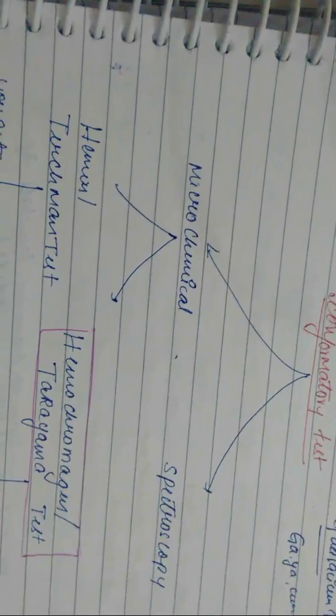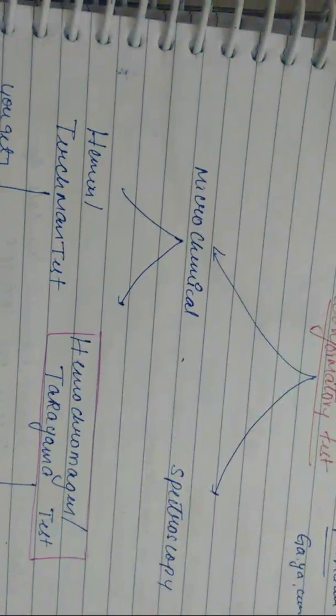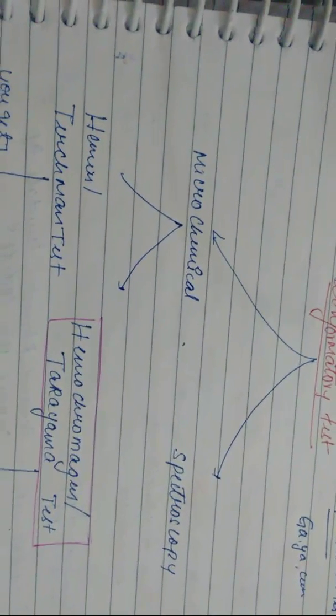So let us go with the first test. It is the Hemin test, or Teichmann's test, the Teichmann hemin crystal test.